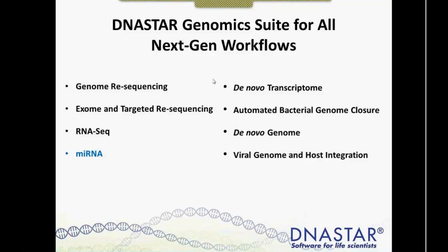And so the workflows can be as diverse as de novo transcriptome assembly to targeted resequencing and exome resequencing to RNA-Seq to viral host integration. So the algorithms are flexible and can accommodate different types of sequence input data. And of course, the algorithm can flex to accommodate de novo or templated assembly.